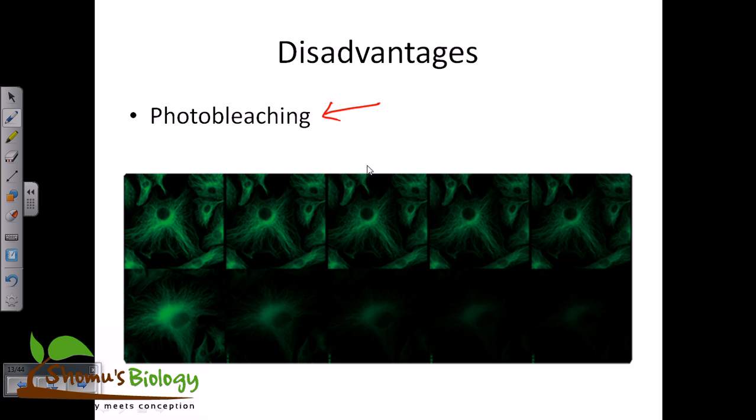So very specific and also quantitative arrangement. But the problem is, as we are doing this experiment over time with the same chemical agent, the same GFP protein, over time it loses the ability to provide fluorescence light. So as we go on with the same dye over and over through the experiment, that is called photo bleaching. That means the intensity of the emission light is getting very low, and the camera and detector will not capture it very well, and we cannot see better resolution images in the further cycles over time. So that is a problem with this type of fluorescence microscopy.